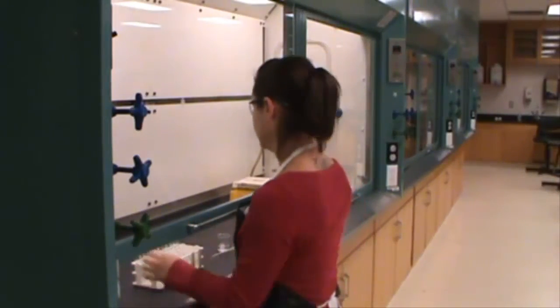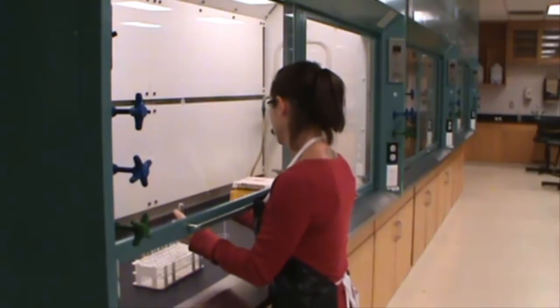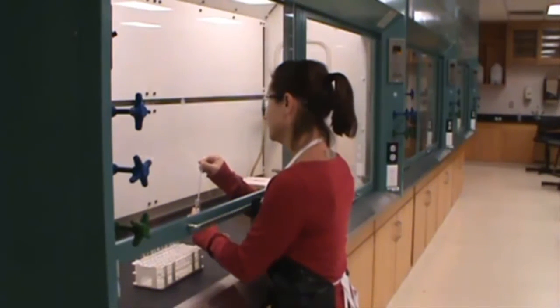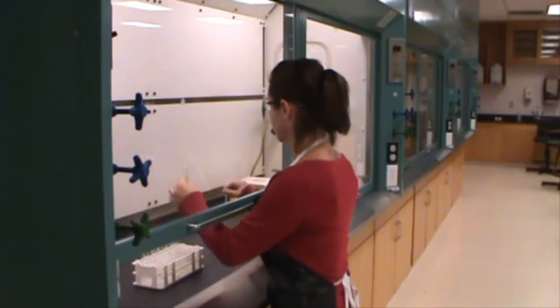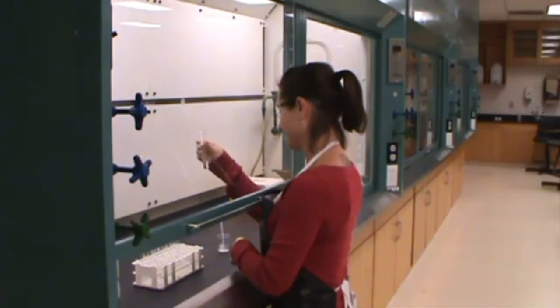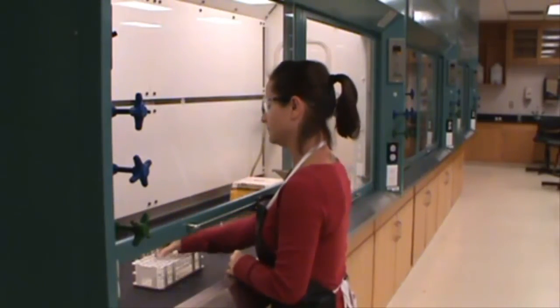You'll be working in the fume hoods during this lab. This means that you need to keep the shield down and only your arms are allowed inside the hood. If you need to look closely at something, hold the glassware up and look through the glass shield. Please note that the glass shields will be up for this video for filming purposes only.